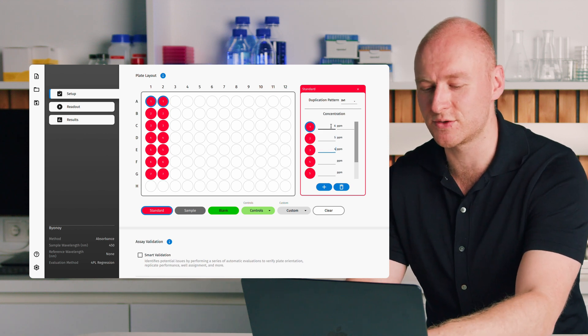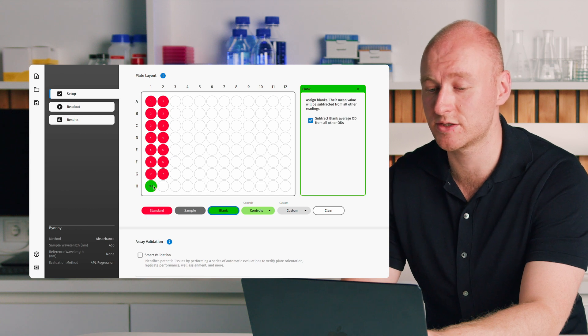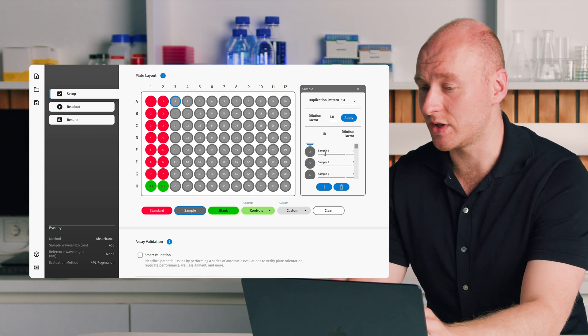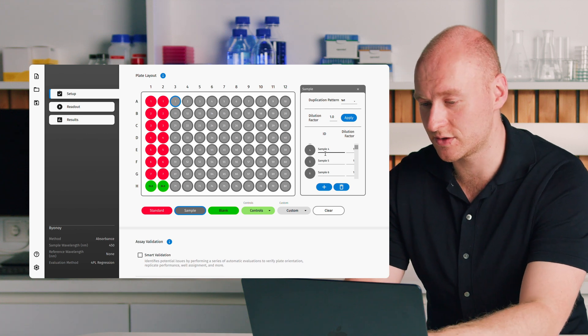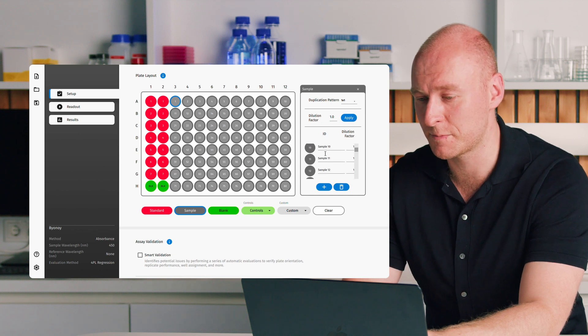I'll enter some fictitious concentrations here just to get some results — you would of course enter your real concentrations. We can then define some blanks and a bunch of samples. You also have the option to add sample IDs, which can be copied from an Excel file using copy and paste. We also have a dilution factor you can apply to samples, and various controls available for different experiment types such as ELISA. We also have custom well types so you can define your own type of control or additional well type.